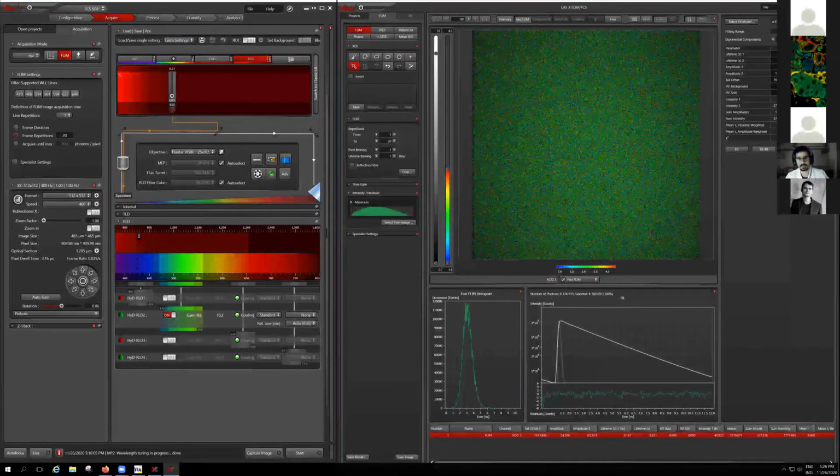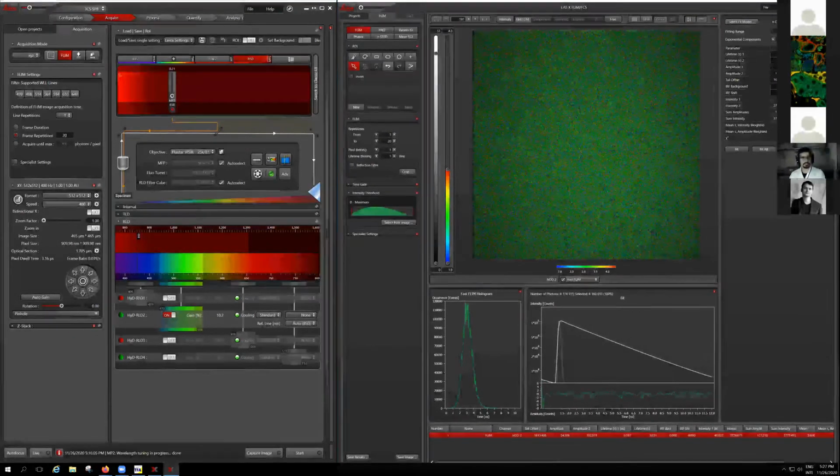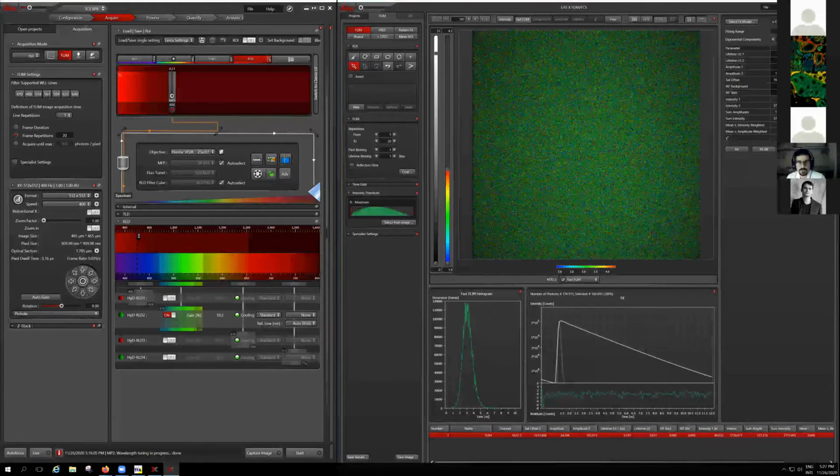So that might be because of some imperfections coming from the system. I don't know. But I was expecting to see something like this value in the very first hand. Is there anybody that would think that I should go for 2 component fit now? You can just unmute your mic and talk if you think I should go for 2 component fit now. Okay, nobody thinks so.